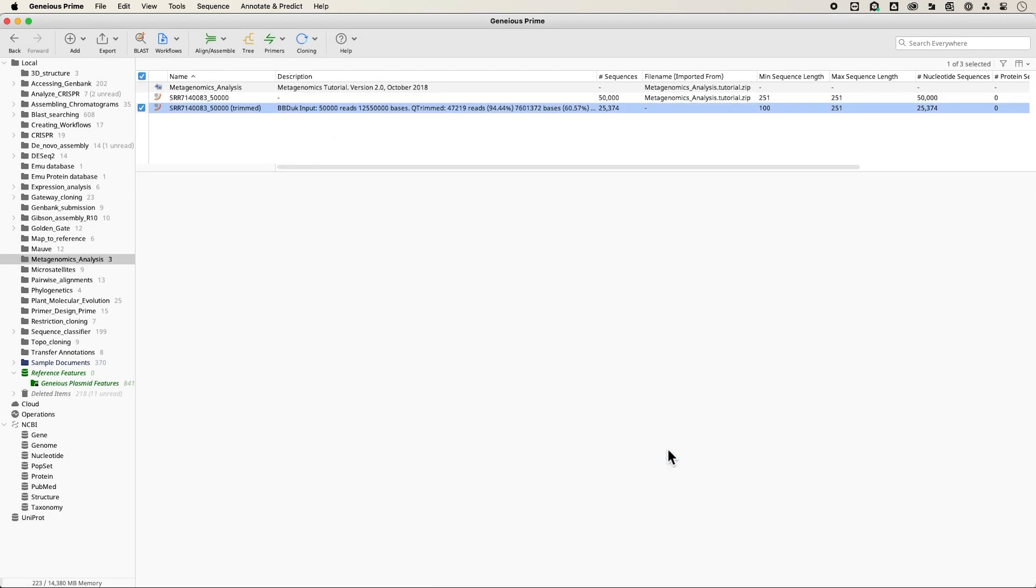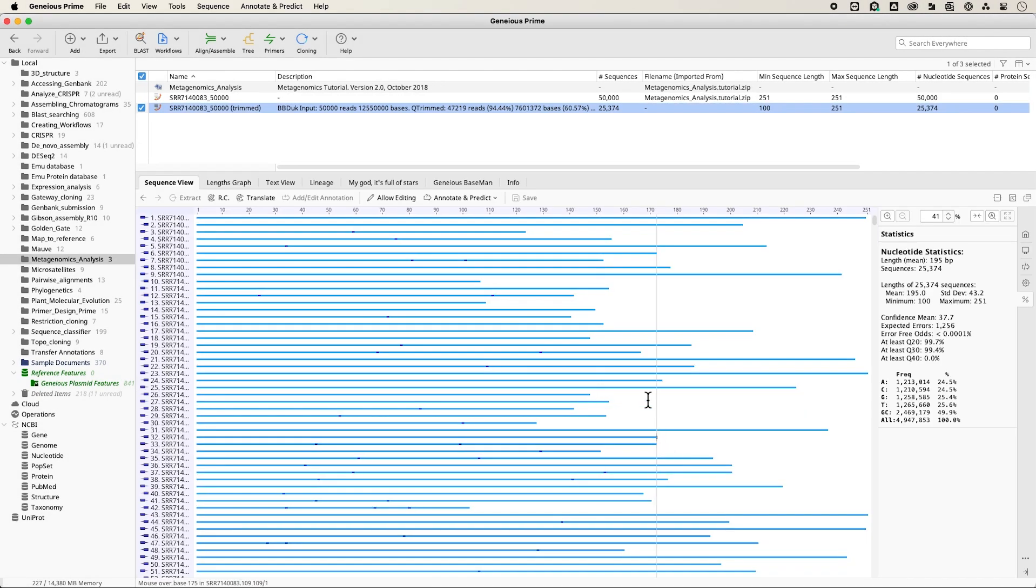Once the trimming is complete, a second file containing your newly trimmed reads will appear in your document table.